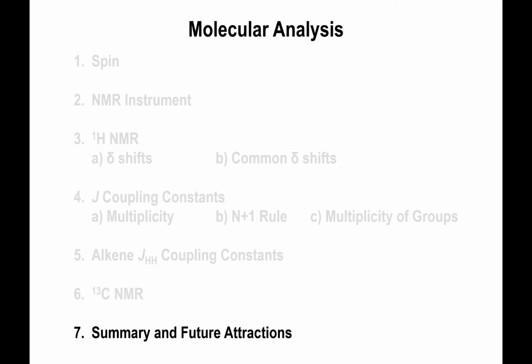Okay, and with all that information said, we've basically covered all of the aspects of NMR that you need to know to be able to successfully determine the structure of your molecules. Now, what I would recommend that you do in the future is practice problems, look at spectra, and use the spectra to determine the molecular structure of your organic molecule. That's basically the core of this chapter. So practice, practice, practice makes expert. And hopefully with the information here, you have enough info to tackle these problems.